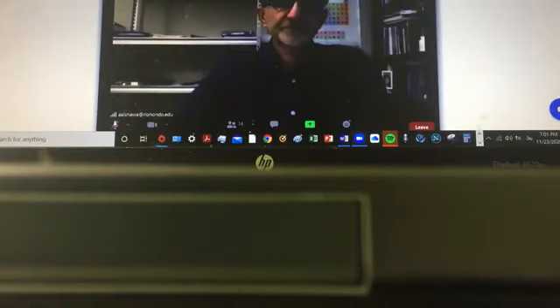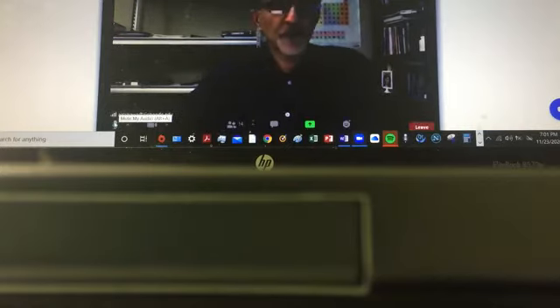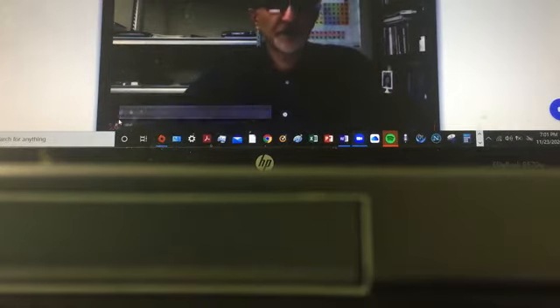So it looks like we only need to deal with one trial in the calorimetry sheet tonight, because the second trial might take more than the time dedicated. So we'll do one trial.